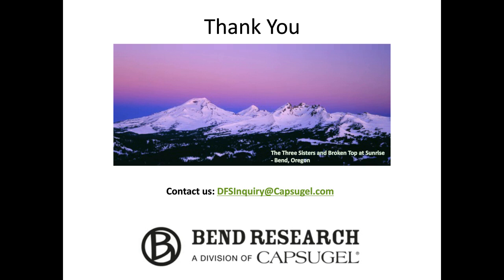The first question is, what is the typical volume required per sample? That's a good question. The Sample Pilot SP200, which is used most, pulls sample in 5 milliliter increments. Generally, the first sample is drawn to clear out the dip tube, and that's usually pushed to waste with purge gas.